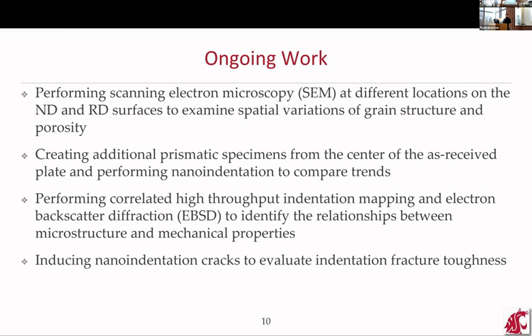Would you expect a significant difference in the properties between the two polytypes you have? That I do not know. I've continued looking into it, but unfortunately there's not a whole lot out there on specifically 4H and 6H, especially for polycrystalline. There are a couple of things on how they differ in single crystal, but nothing too close to this exact situation. In reference, we do have single crystals of 4H and 6H if you want to test them. Oh, that'd be interesting.